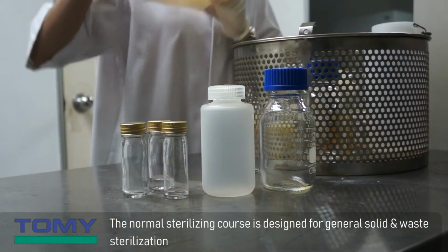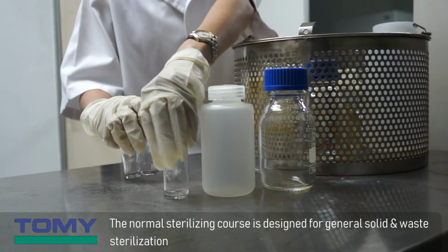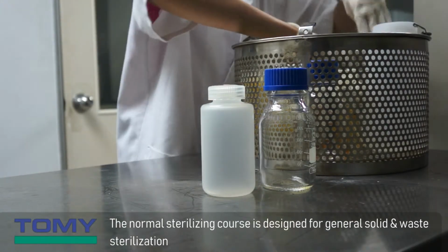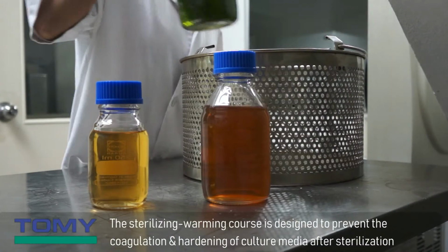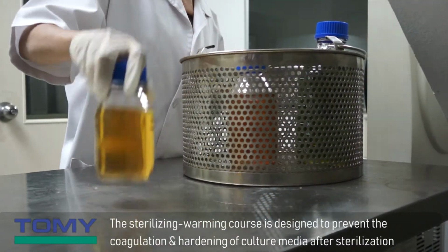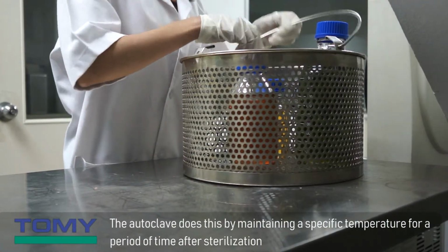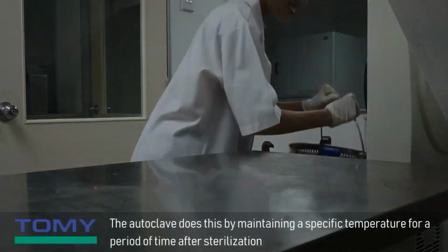The normal sterilizing course is designed for general solid and waste sterilization. The sterilizing warming course is designed to prevent the coagulation and hardening of culture media after sterilization. The autoclave does this by maintaining a specific temperature for a period of time after sterilization.